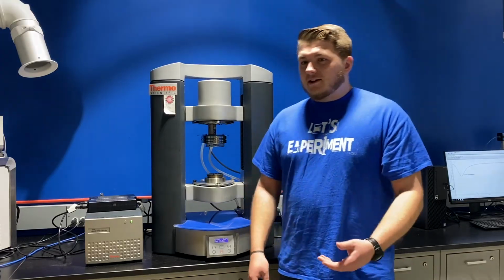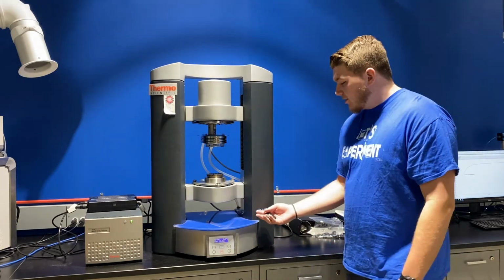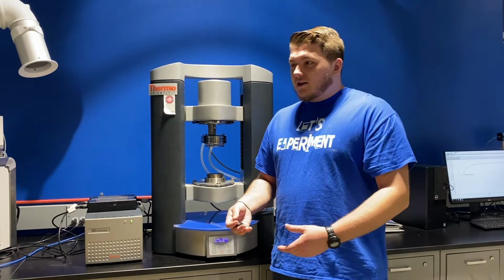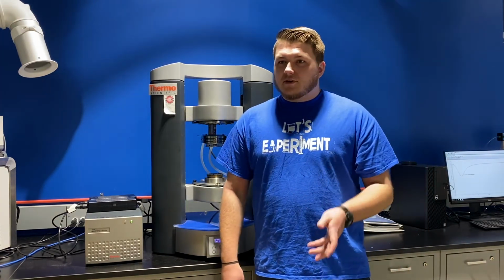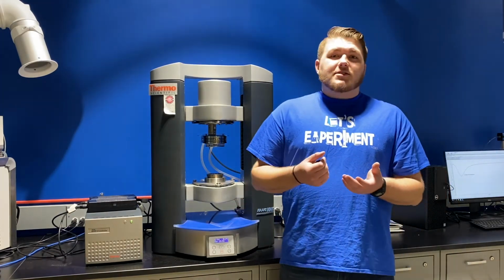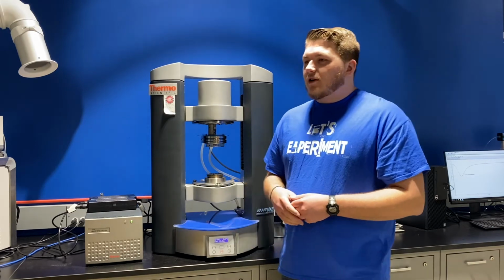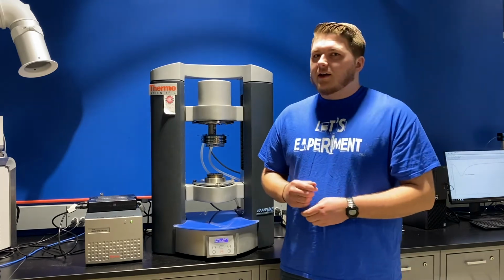Hello everybody. In this video, we're going to be talking about our rotational rheometer, specifically our HAAKE MARS rotational rheometers. MARS stands for Modular Advanced Rheometer System. Advanced because it can tell us a lot of things, not just rheometry. It can also tell us about creep, relaxation, and creep stress, other things such as G prime, G double prime, and various other factors, and we'll get into that a little later on.